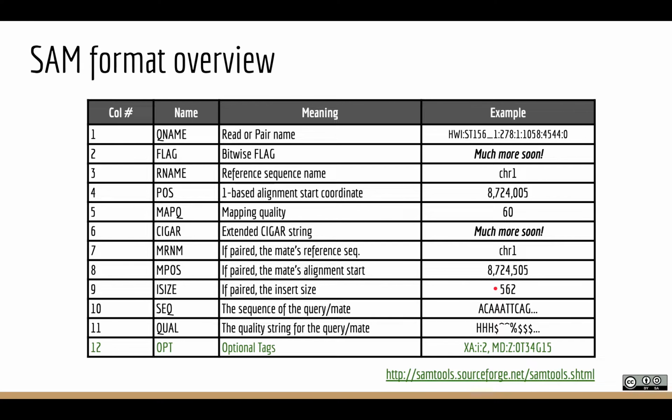And the next column kind of gets at that. It's about 500. It says 562. Why is it not just 505 minus 005? This coordinate is actually talking about the leftmost start of the alignment, so it could continue on the length of a given sequencing read. Okay.